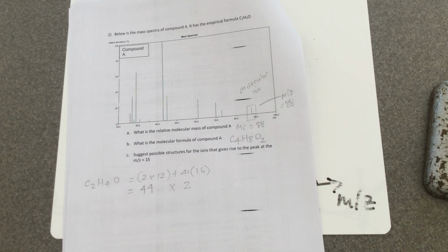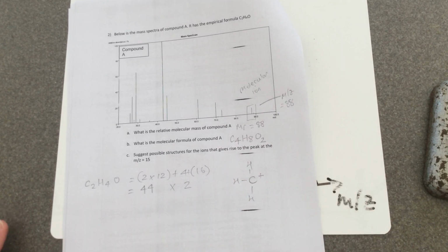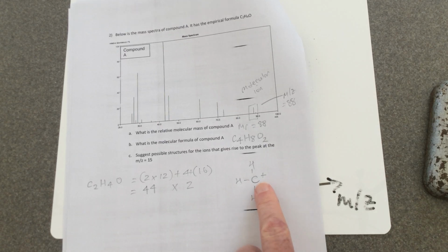Now, if I was really, really good at interpreting fragmentation ions, I'd be able to find out lots and lots of things about this molecule. All I'm being asked to do is, can I identify an ion that has a mass of 15? Well, typically, a carbon with 3 hydrogens attached, if that's present in a molecule, when the high energy electron hits that molecule, bonds can be broken, leaving this fragmentation ion behind. That's got a peak at MZ 15.